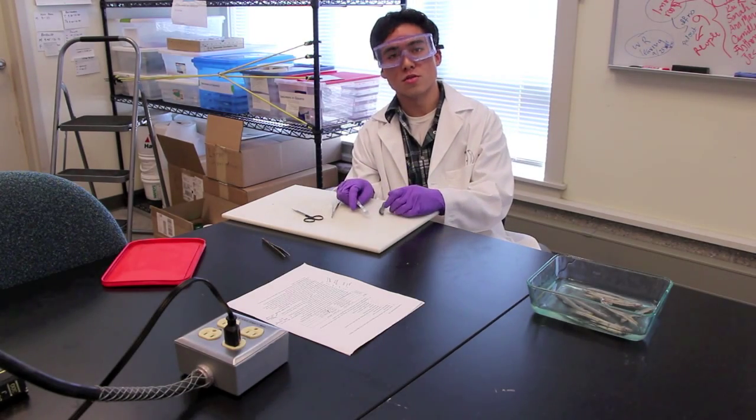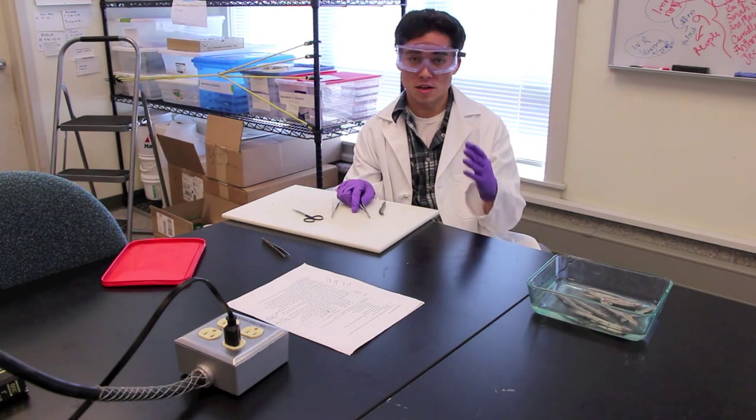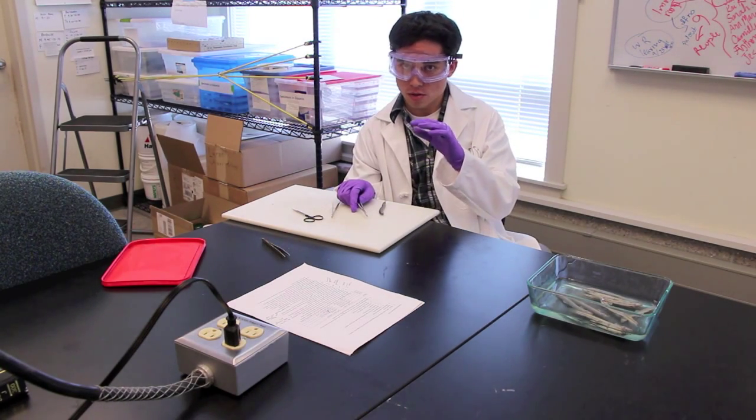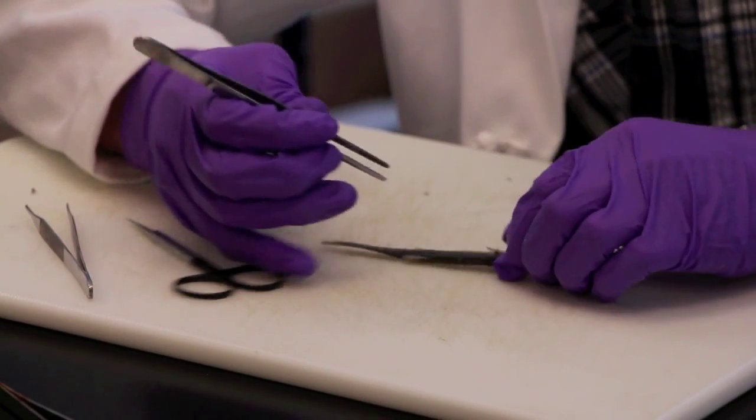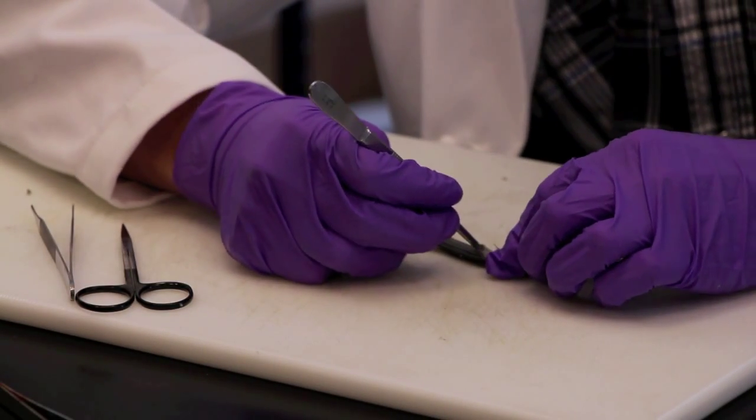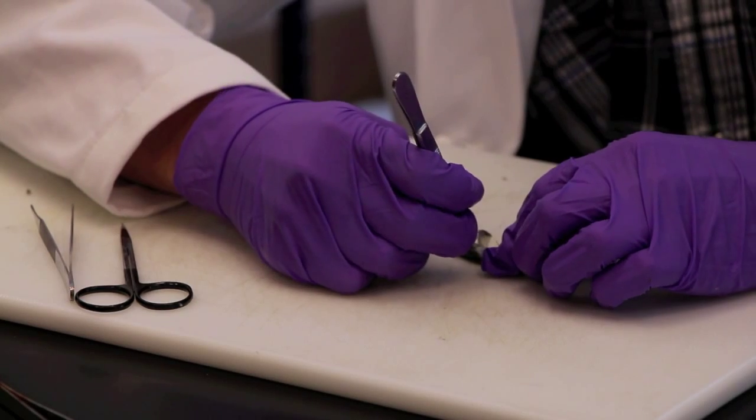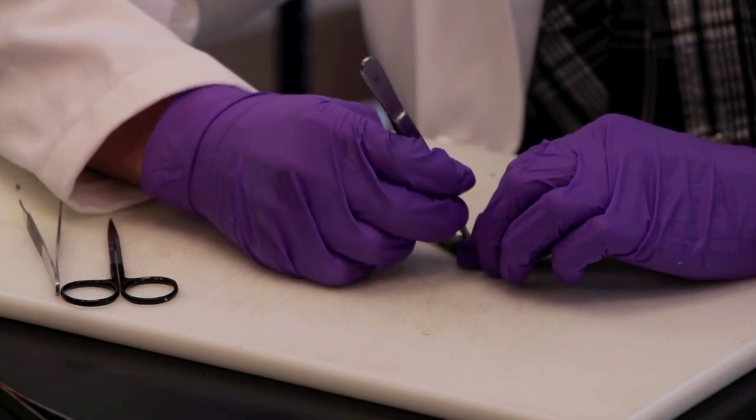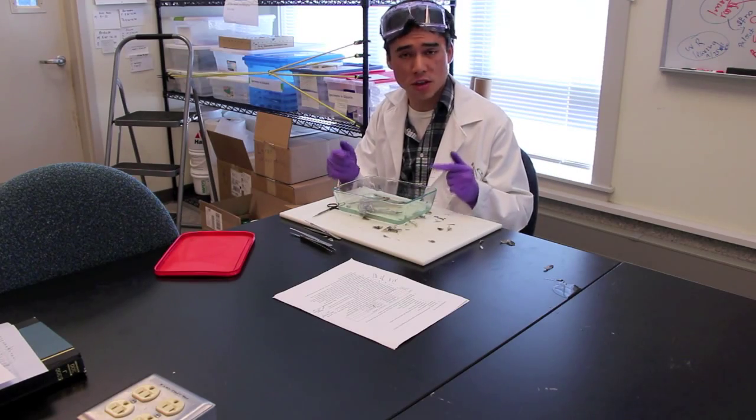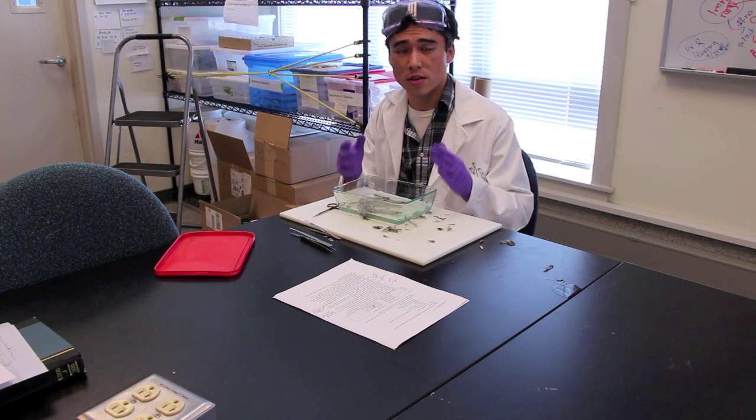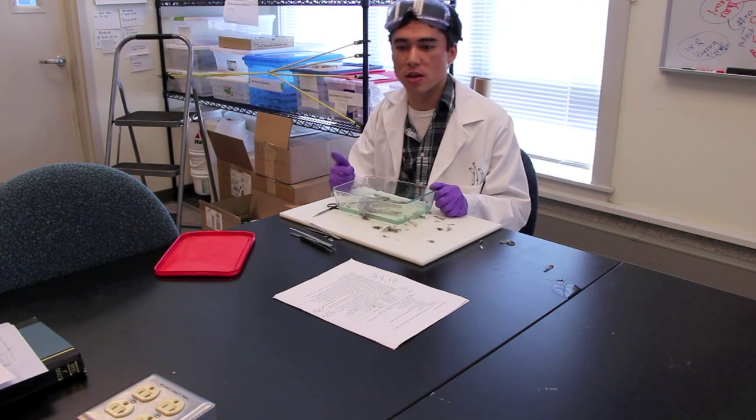Next, we'll skin the specimen to ensure the chemicals that we're going to be using in the next steps are able to penetrate all the way to the skeleton. Okay, so I've just finished skinning the last of the specimens. So that means it's off to the first step of the clearing and staining process.